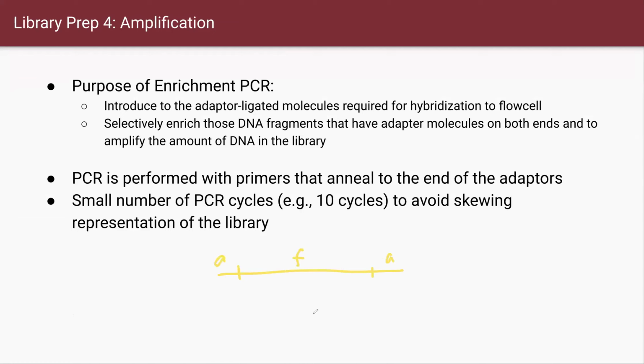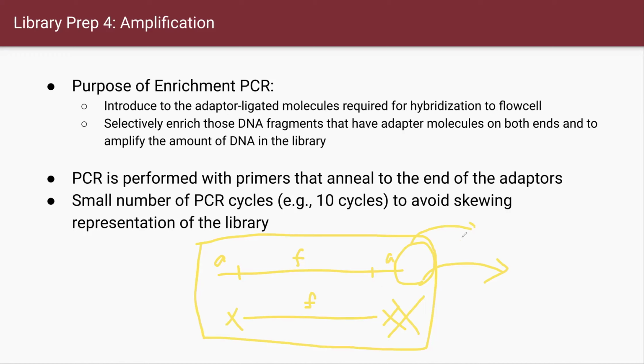So if you have this amount of your sample, you cannot see that, right? Because this is in the water, in a reagent. So you put it into the sequencing, then half of the sequencing is done by this one and half is not done by this one. So it's a waste of your data. It's a waste of your experiment, right? So you want to make sure that you enrich those adapter-ligated fragments into a large proportion.